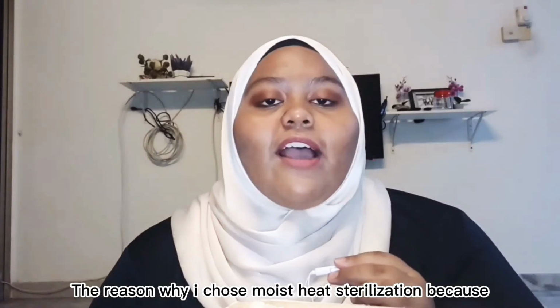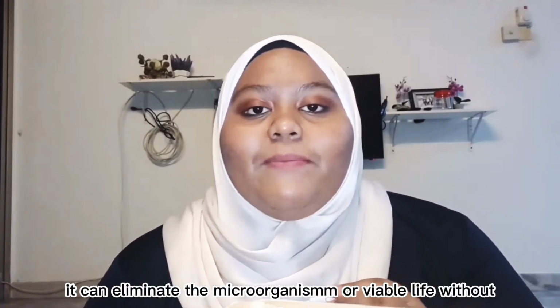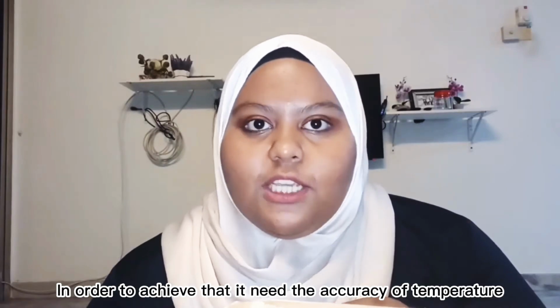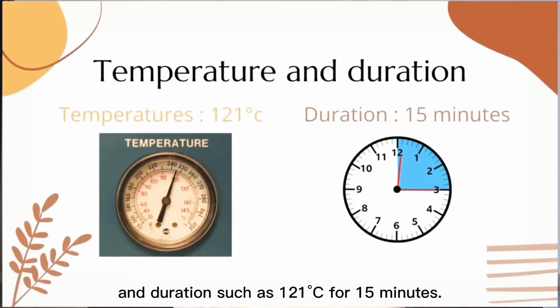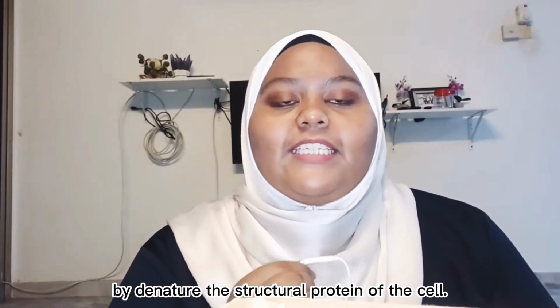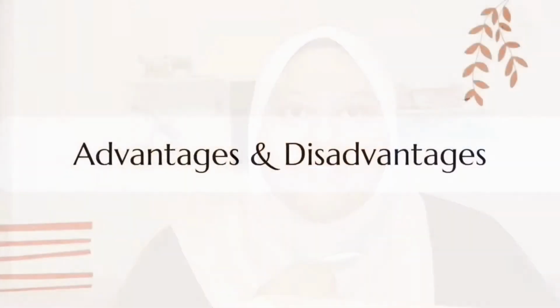The reason why I choose moist heat sterilization is because it can eliminate the microorganisms or viable life without changing their physical and chemical properties. In order to achieve that, it needs accuracy in temperature and duration, such as 121 degrees Celsius for 15 minutes. The mechanism of action for moist heat sterilization is by denaturing the structural protein of the cell.